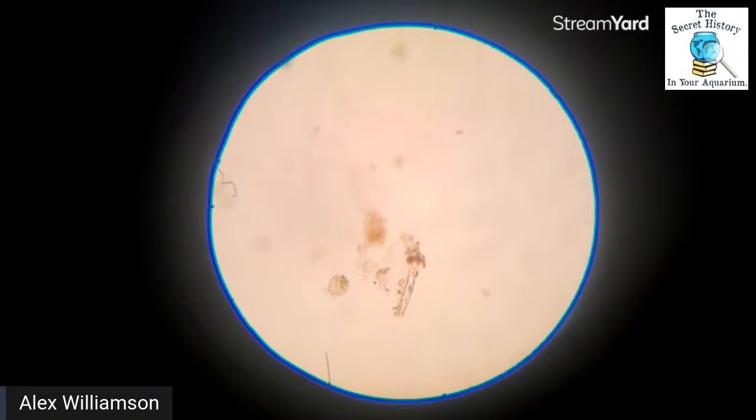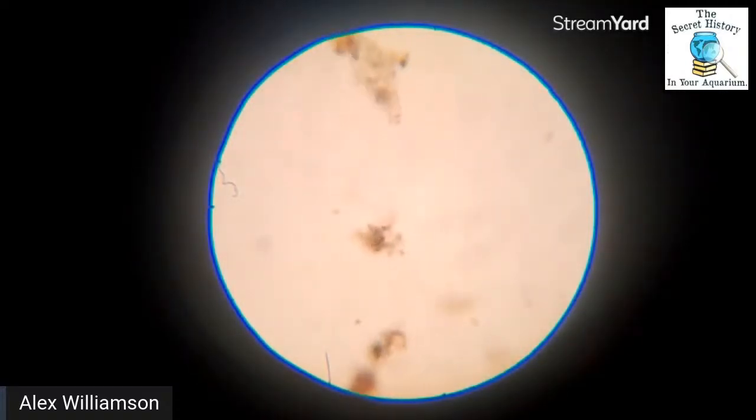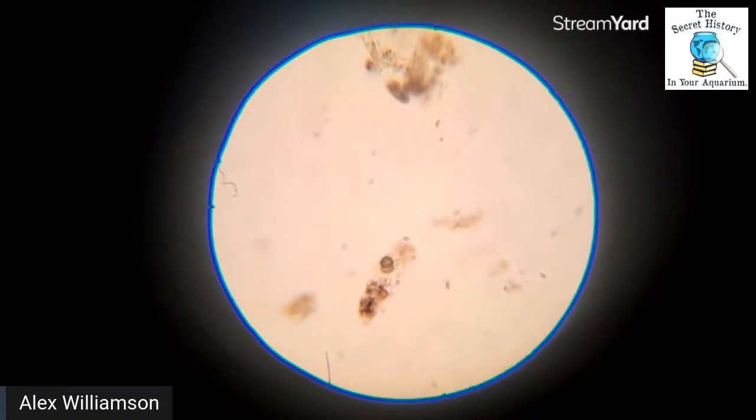So yeah, in any case, we can see that the little whirligig guys are in the freshwater too. And let's try to find some of the bigger stuff that was zooming by a second ago. This is all in an eyedropper of water, and again, this is from the outside tank, but it's warmed up. So whatever was in there hatched. There we go. There's some paramecium looking good for us with all the little whirligigs, and it looks like some cysts too. Also, I see that we have a nematode.